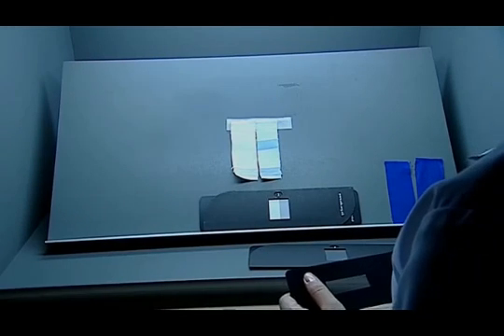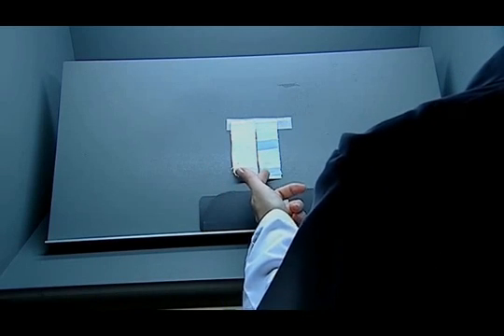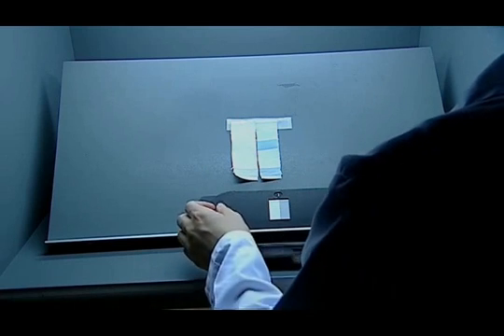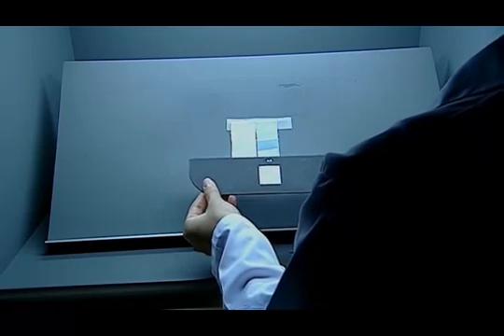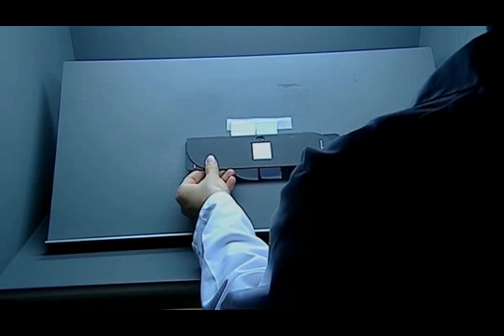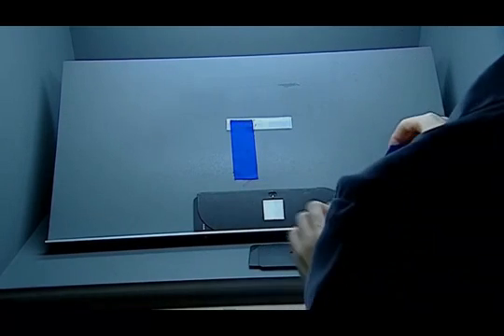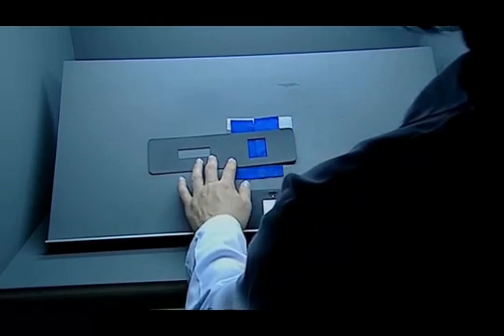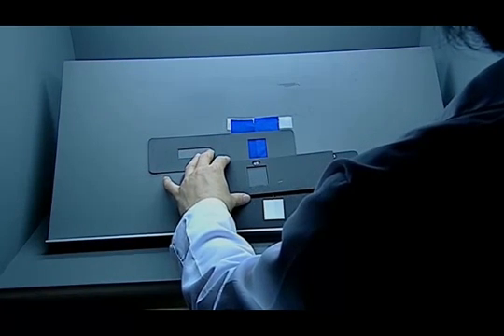To evaluate the colourfastness against the washing test, the original sample is put on the left side and the tested sample is put on the right side. The staining is evaluated with the greyscale, which has levels from 1 to 5, and is placed on the tested sample to find the appropriate level. Then the tested sample and original sample are put side by side and the fading scale, rated from 1 to 5, is used. The evaluation of the sample is finished by finding the appropriate value.